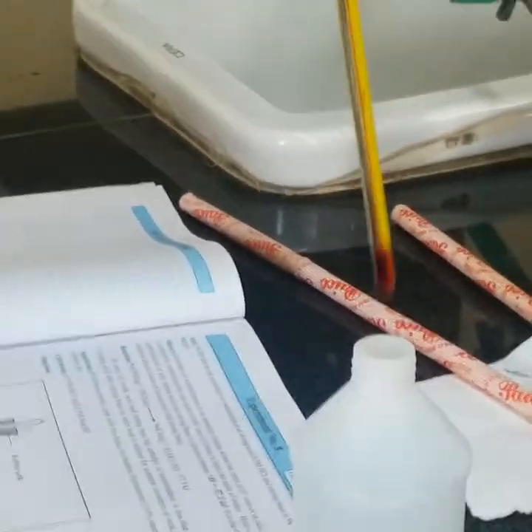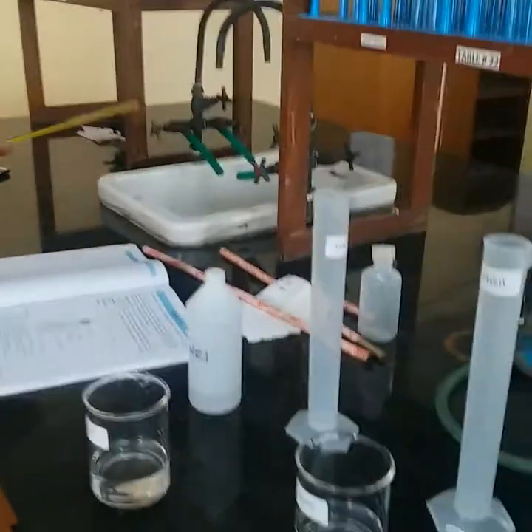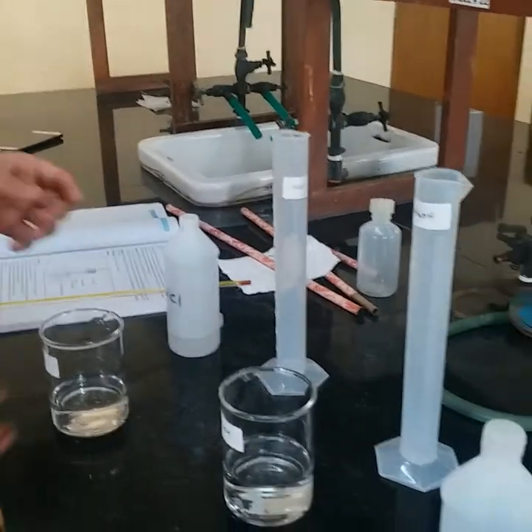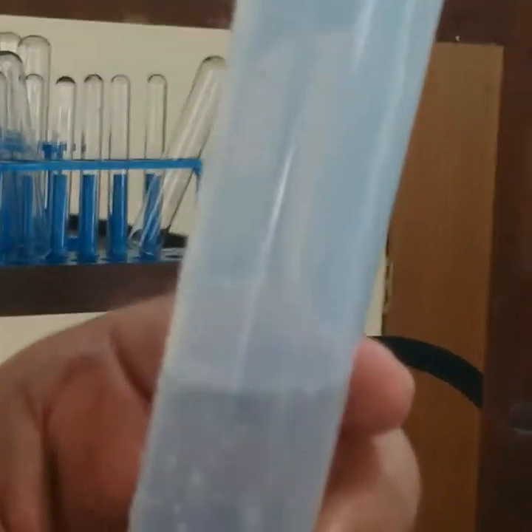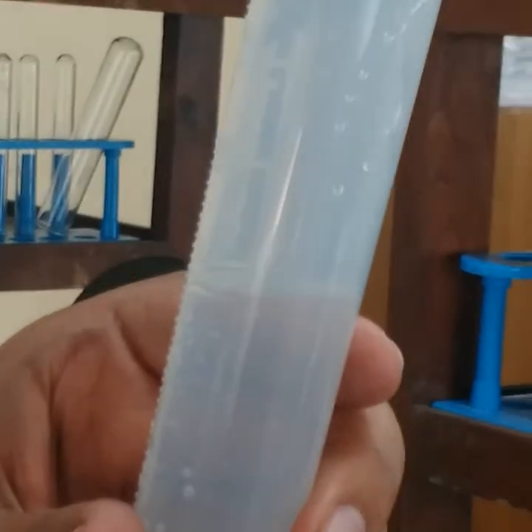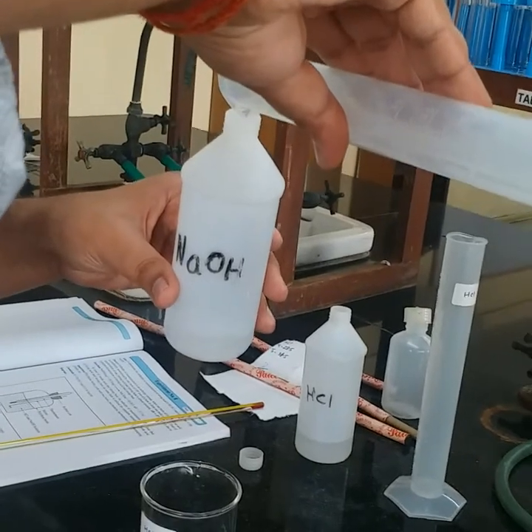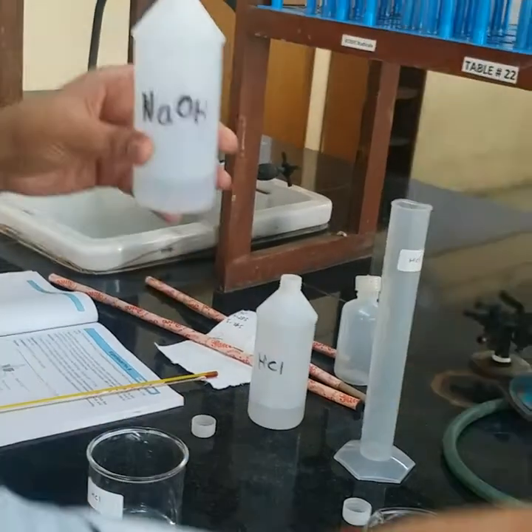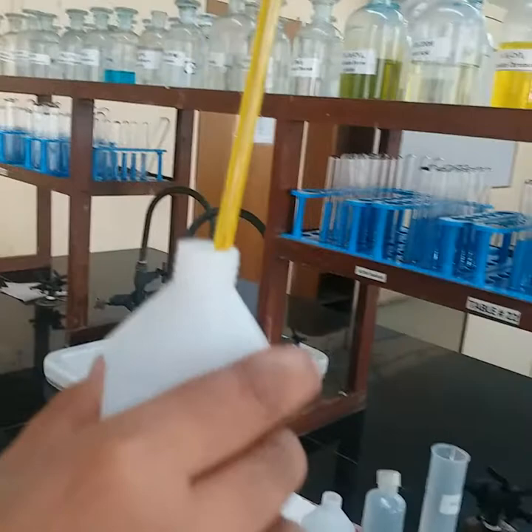Now I am washing this thermometer with water, because I have to take the temperature of NaOH as well in the same way. I am now taking NaOH — 50 ml. I am transferring it into the NaOH polythene container. I am then again measuring the temperature of NaOH. This temperature is my T2. The temperature I took initially for HCl is T1.